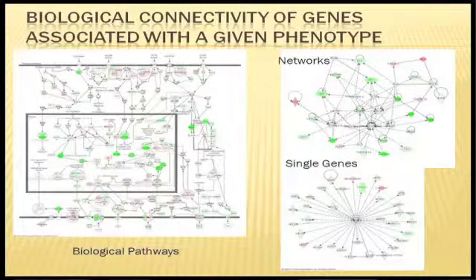So what I mean, let me give you a visual. If you think you've got a list of genes that are important in, say, a disease you're studying, a high proportion of them are probably going to be involved in similar biological pathways. And you can actually see that when you look at the array data and superimpose that on these pathways.